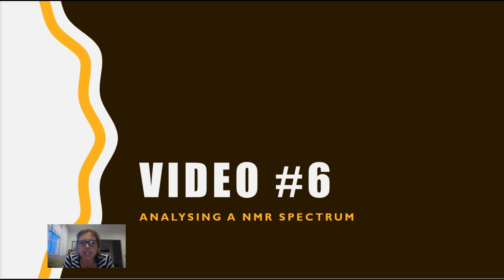We've looked at the unique environments of the carbon-13 and the proton or H NMR. And the peaks that we'll see will be based on the number of different unique environments that carbon or that hydrogen has. And that was the topic of our last video. How do we know where those peaks will occur and what they correspond to? And that is the topic of today's video. So let's get started.